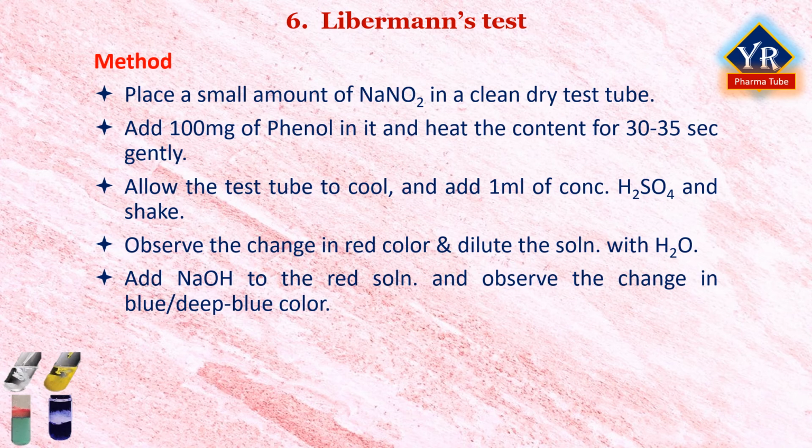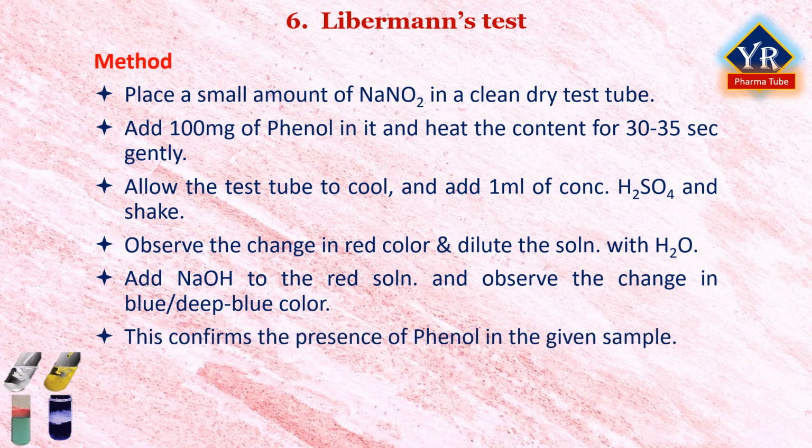When we dilute the solution with water, the solution turns red in color and on adding sodium hydroxide in it, the solution turns blue or deep blue in color. Deep blue color confirms the presence of phenol in the given sample.